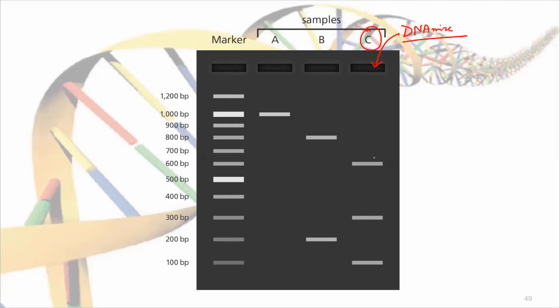So these 3 fragments, you will see that they have settled down at 3 positions, 1, 2, and 3.